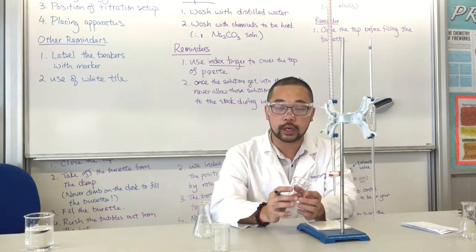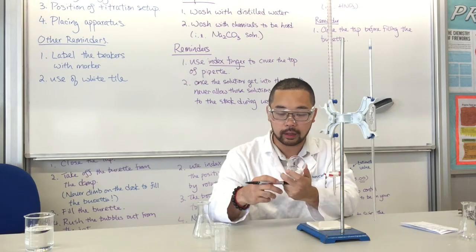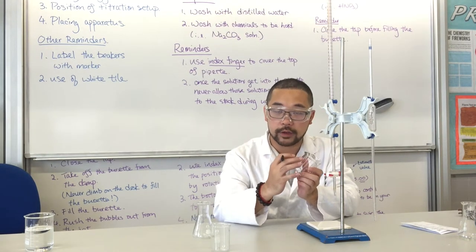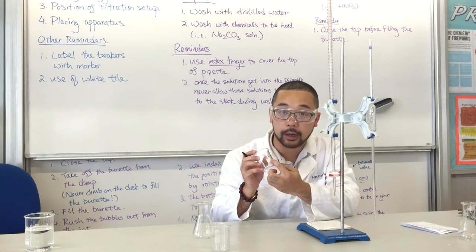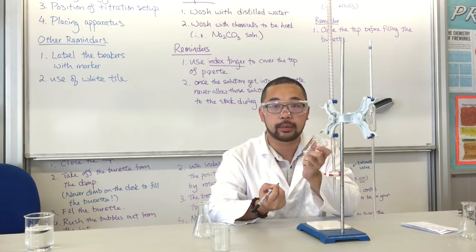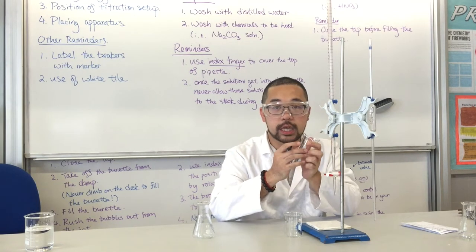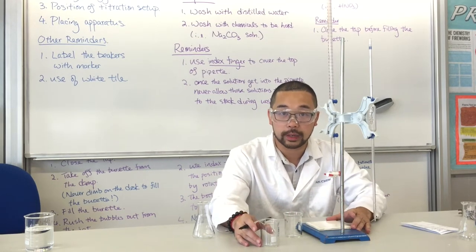So when you are using apparatus like beakers, you have to label what chemicals are going to be held there. For example, right here, this one we're going to have HNO3, and we'll use a permanent marker writing on the surface of the beaker. Do remember, you have to write on the glass, but not the white part on the beaker. So you just need to write HNO3, for example nitric acid, and the other one, just write down Na2CO3. Again, during the SBA, if I see that your beaker has no marks or labels on it, marks will be deducted.